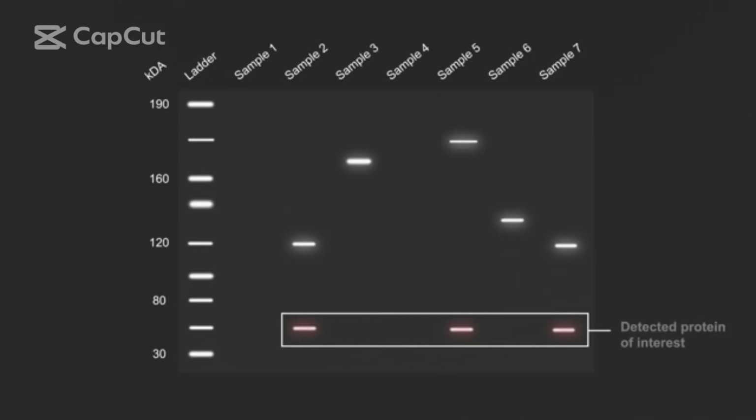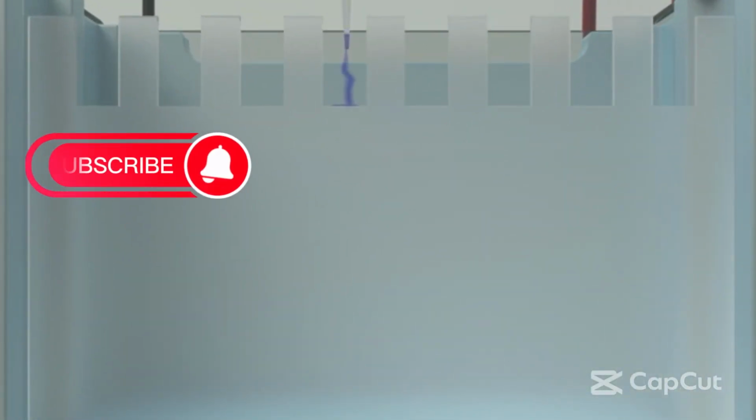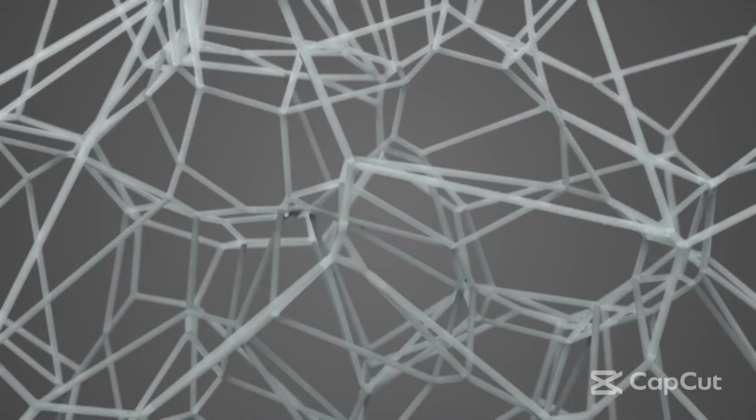Western blotting is a laboratory technique that is used to confirm the presence of specific proteins in a sample. First, protein lysates are prepared and loaded onto different lanes of polyacrylamide gel. Application of a charge pulls the proteins in the sample down toward the bottom of the gel. Larger proteins travel slowly through the gel matrix, while smaller proteins travel more quickly. The result is separation of the proteins in each sample by size.